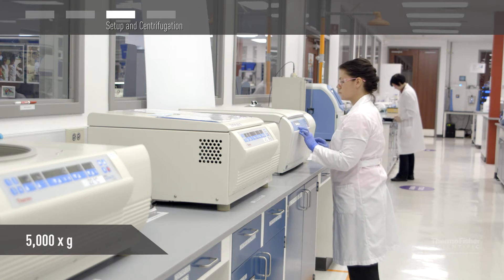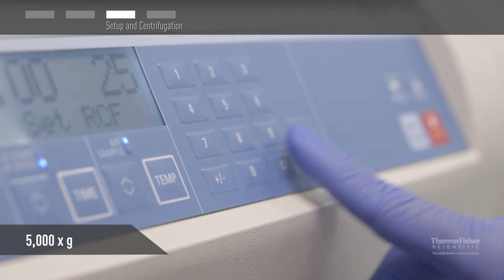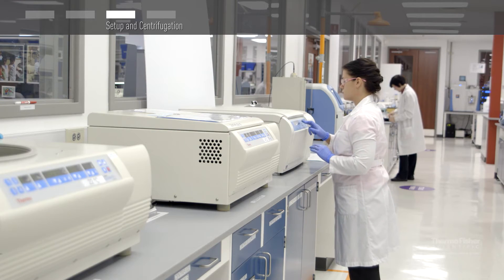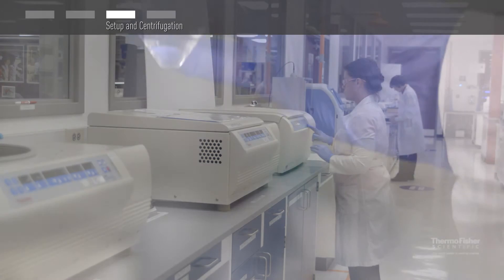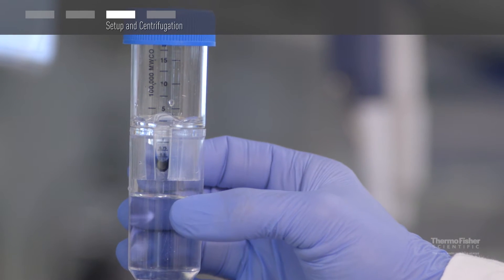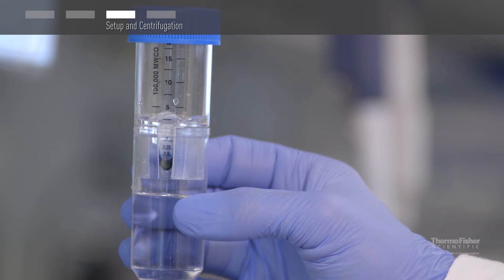Centrifuge up to 5,000 times G until your desired concentration factor is achieved. The dead stop volume is 50 microliters. The retentate volume can be visually monitored through a clear window with graduations on the side of each device.